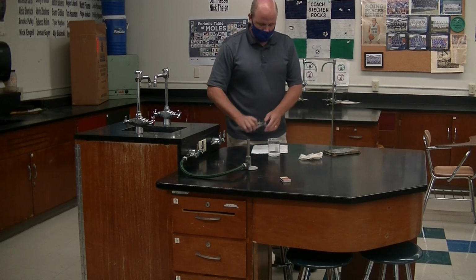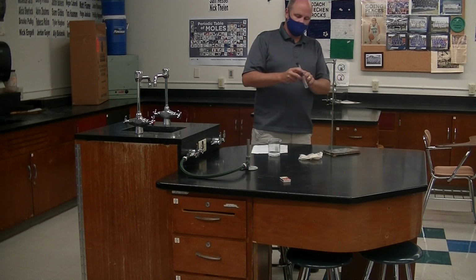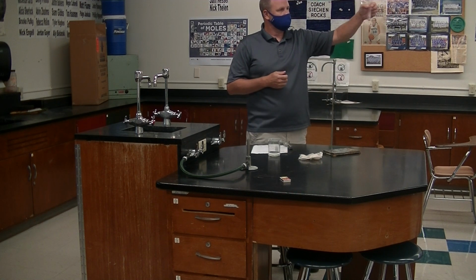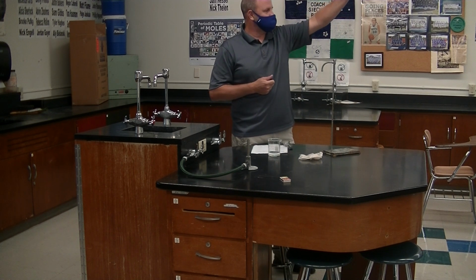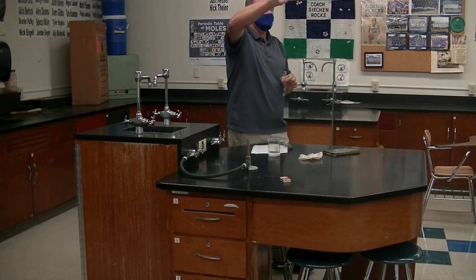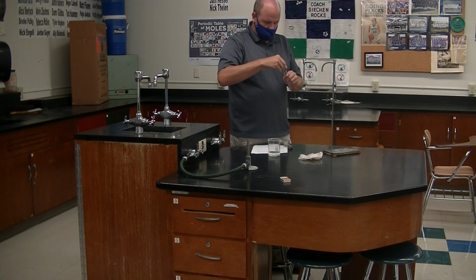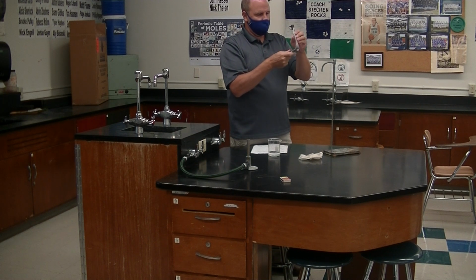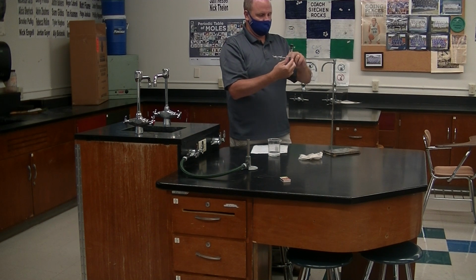All right, I'm just going to go over this terminology before we get going. This thing right here, what's this thing? Test tube. Yes. Remember we had the big one up front. What's this? Stopper. Very good. This is new. What's this one? Now I'll help you out because this was on here. This is called a test tube, right?